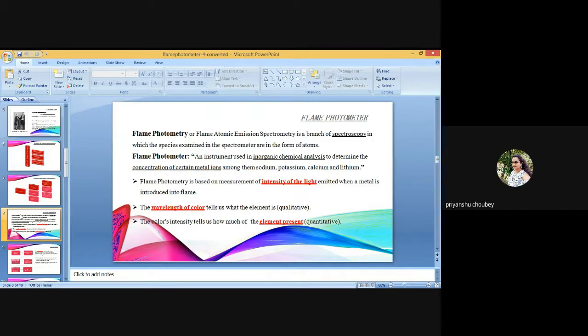Set the wavelength, gain factors, pump types, injections, valve cycle, and the plotting parameters through keyboard commands of the modules as per the requirement of the analysis. If the instrument is interfaced with a microprocessor, the above parameters may automatically be set by default.